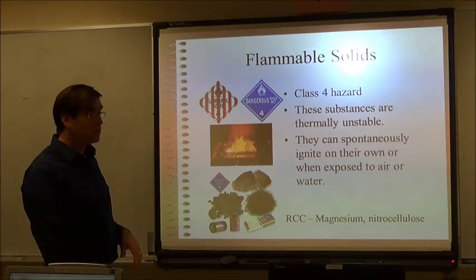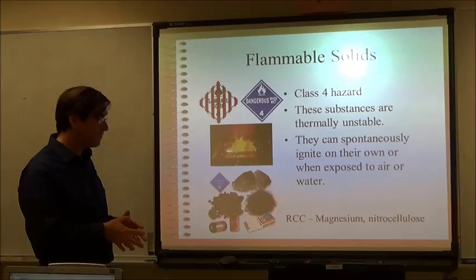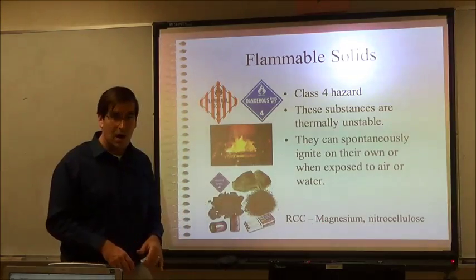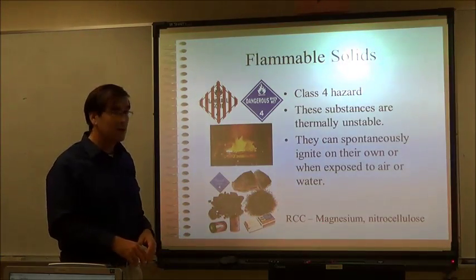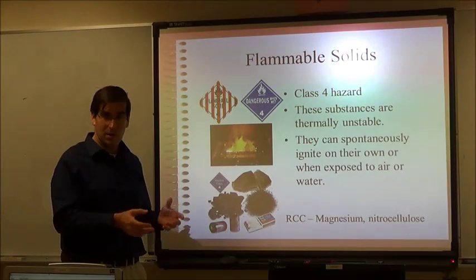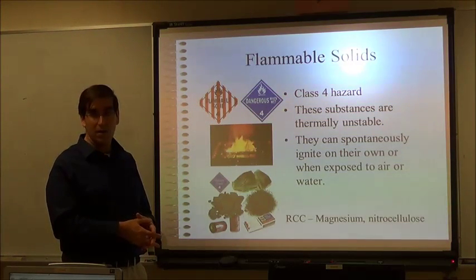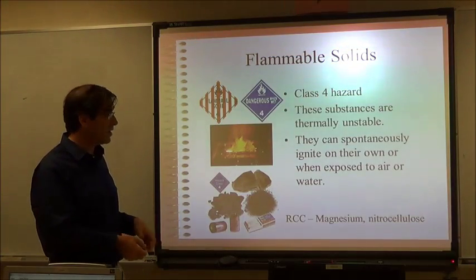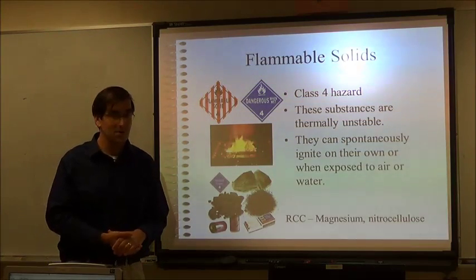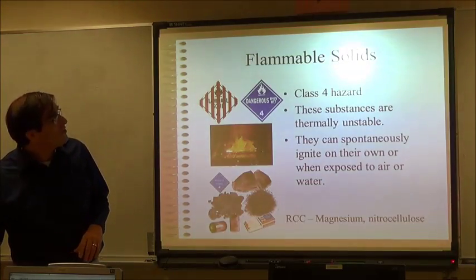Now here at RCC, we don't have too many of these. The only one that I can think of that is used relatively frequently or yearly in the labs are the magnesium strips and ribbons that we use. And these things, like I said, they are flammable solids. They need to be handled appropriately. The waste from them cannot just be left lying out in the hood. We actually have to collect this and store it in oil, and the oil will keep it from, in theory, igniting. Things like nitrocellulose are also potentially flammable solids. However, personally, I've never actually seen nitrocellulose suddenly combust, but it is technically rated as well.